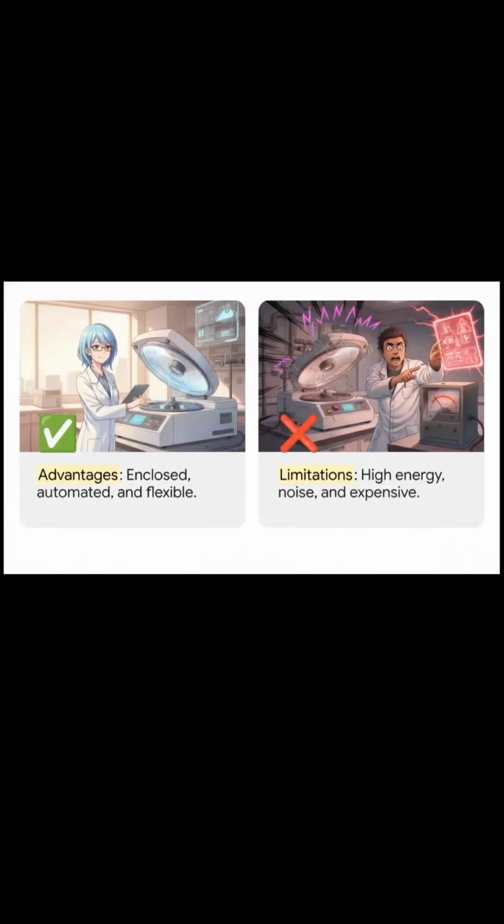Of course, while centrifuges give us incredibly fast, enclosed, and easily automated separation, we do have to acknowledge the trade-offs. Generating that much rotational force demands massive energy consumption. Plus, it produces unavoidable noise pollution and vibrations. And since these are highly sophisticated devices, when they malfunction, they require expensive specialist maintenance. This means labs almost always have to shell out for backup machines. And finally, they inherently struggle to separate exceedingly light particles that have almost negligible mass.